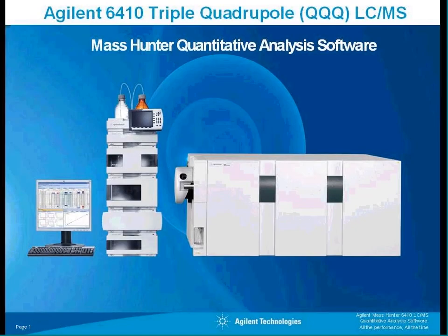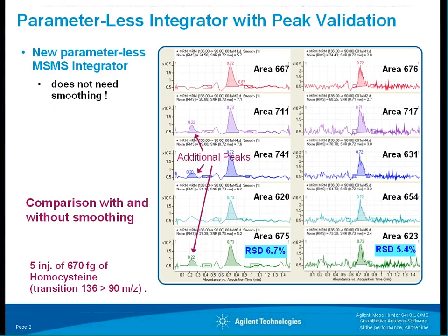Now, we have several different kinds of integrators, and specifically for the MS-MS integrator, I want to point out that smoothing is not considered a recommended practice. This slide, which is covered in the MS-MS integrator section, attempts to point out the fact that the integrator is designed to deal with the noise and uses that as a statistical measure in figuring out the peaks, as you can see down the right-hand side here.